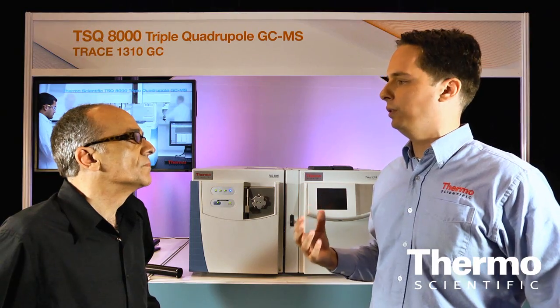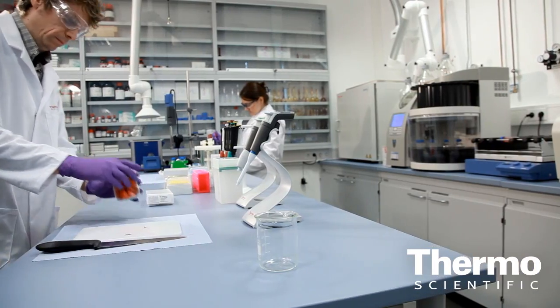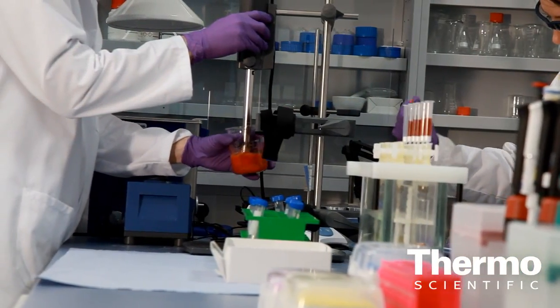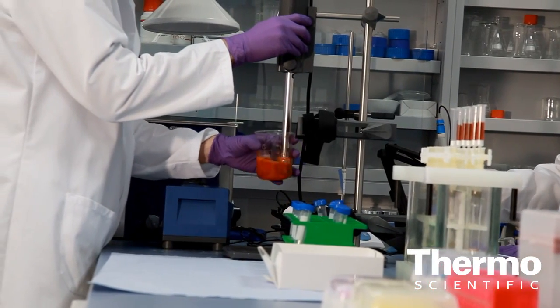One of our main customer segments looking at this instrument is food safety laboratories. They're looking at very dirty matrices, at least in terms of mass spec — vegetables, food — things that can contaminate the source quickly. So our number one design goal is to make this a workhorse for the laboratory.